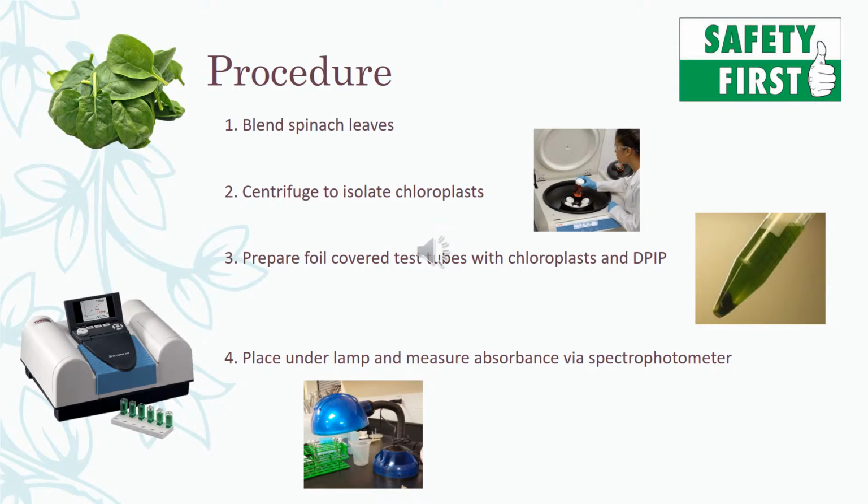DPIP and SPP are skin and eye irritants, so I used a lab coat and gloves in the biochem lab. I labeled everything I used and disposed of solutions in waste bins under the hood after I finished my lab.